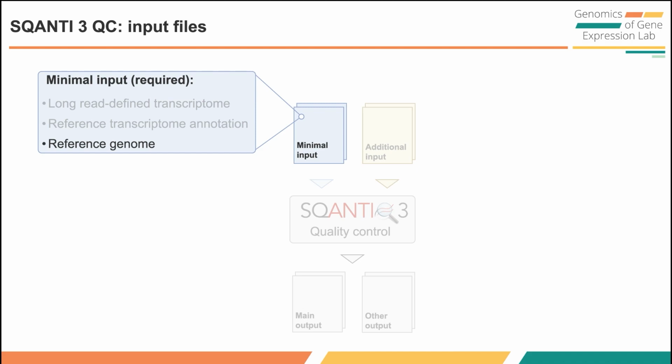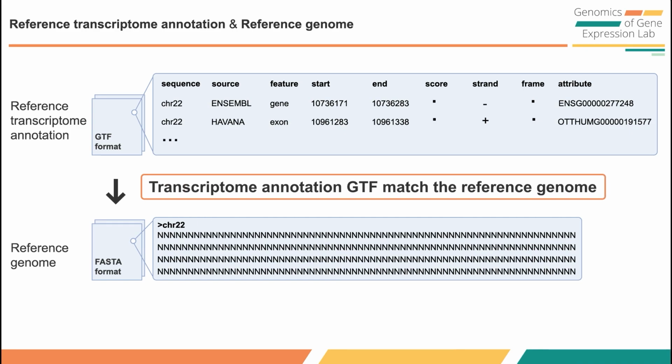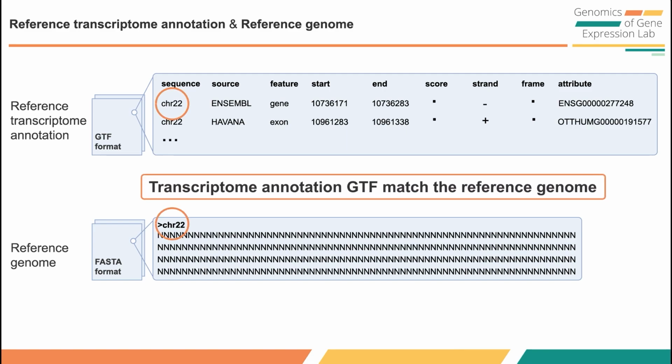Before running SQANTI3, make sure of the following. The transcriptome annotation GTF must match the provided reference genome. The chromosome or scaffold names must be the same in the reference annotation and the reference genome.